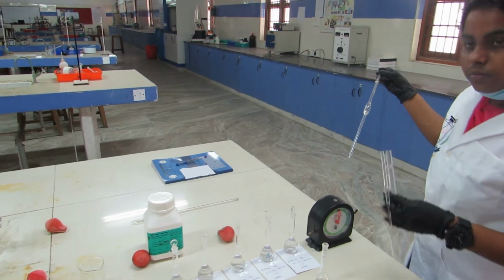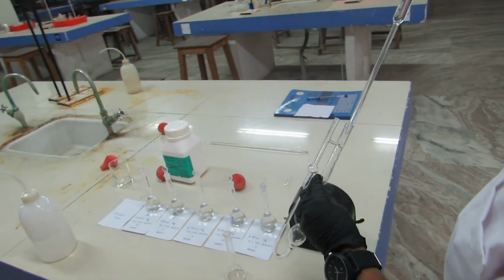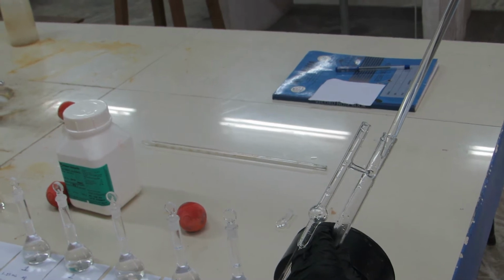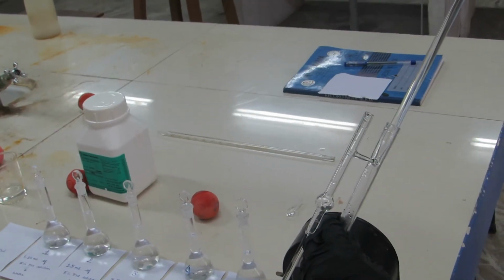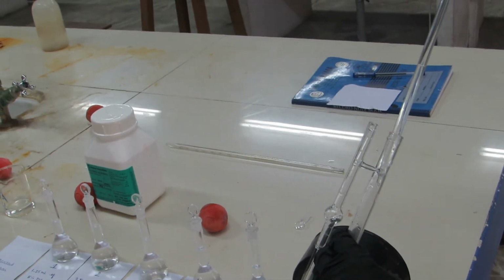So on the right side tube. Once you release the water from the pipette on the right side, you have to release the entire water into the viscometer. Even a single drop of water should not be left in the pipette.